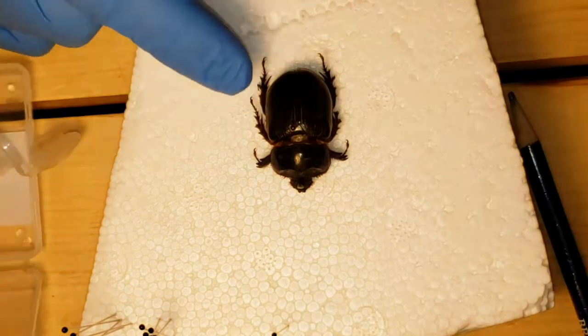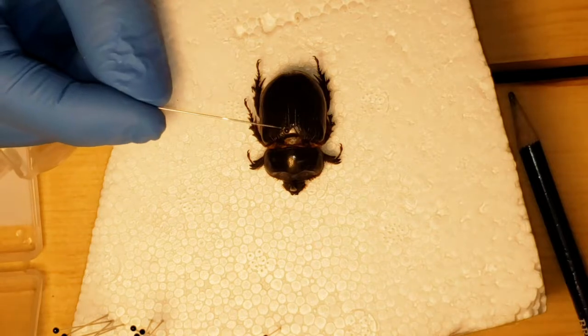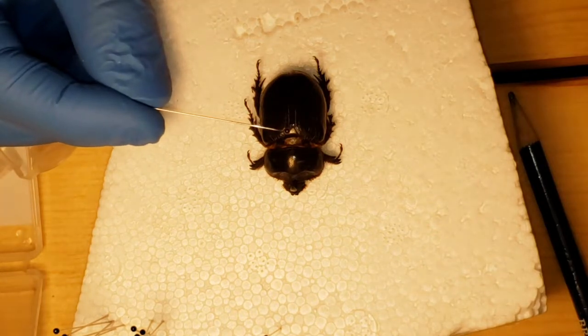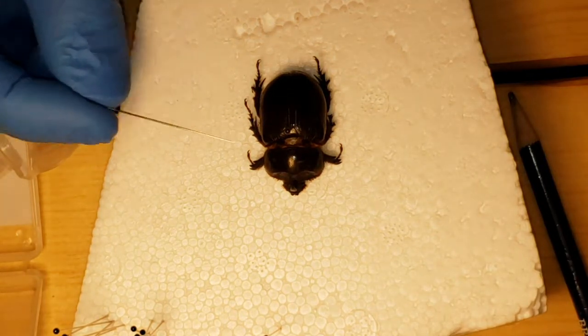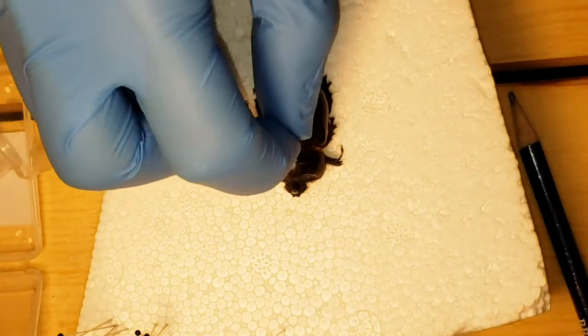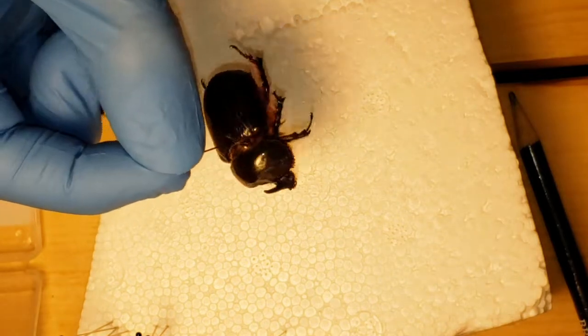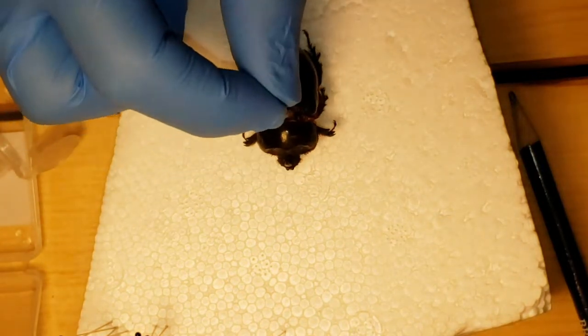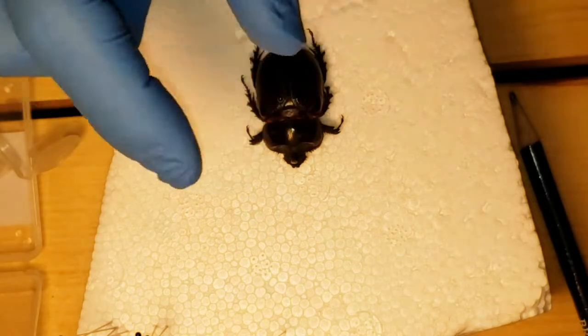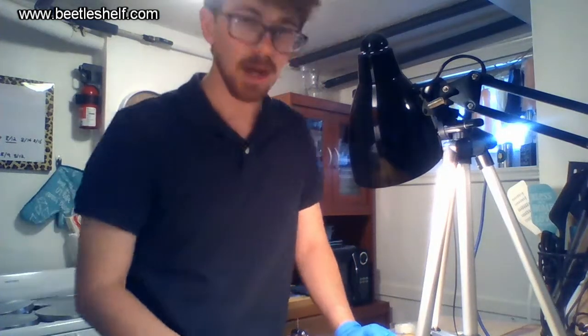I have the pin right there — the pin goes through right there. You get it as close to 90 degrees as you can through the beetle, make sure it goes pretty straight through. Mine's not super straight because I'm still learning how to do effective pinning. Beetles are hard because the elytra casing is very difficult to go through on your first needle.